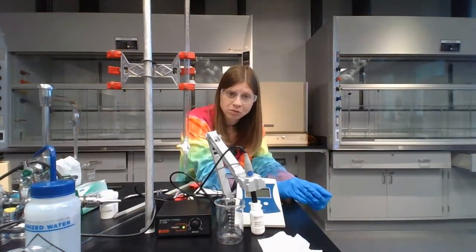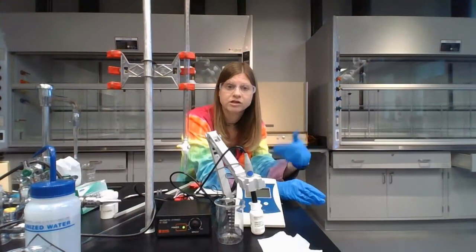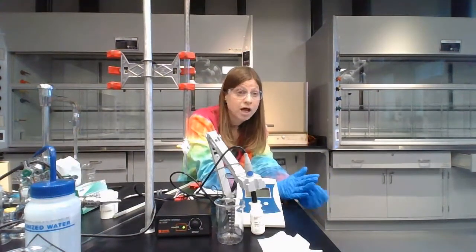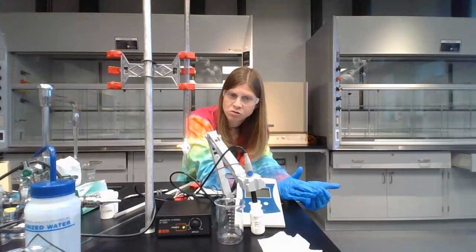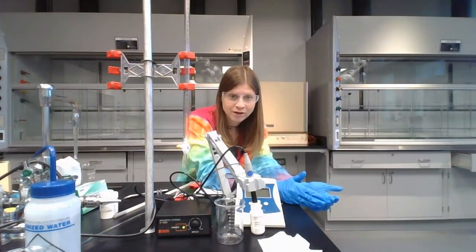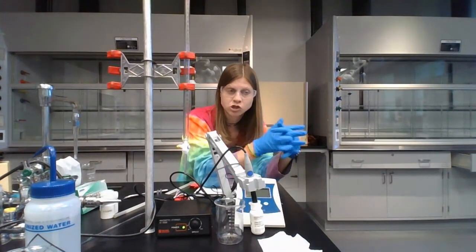Once I get to 22 milliliters, or whatever the end of your equivalence point is, then you go back to ones. Then you'll go to 23, then 24, then 25. You'll continue the titration, not stopping until you have two values right next to each other in the pH column, which means that a pH value is plus or minus 0.03 from its next pH value. If you have questions about this while you're in the lab, absolutely ask your instructor. If you want confirmation of the range where you're going to do your 0.1 milliliter increments, it's good to have that double checked.